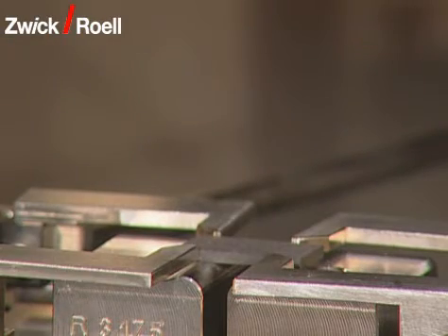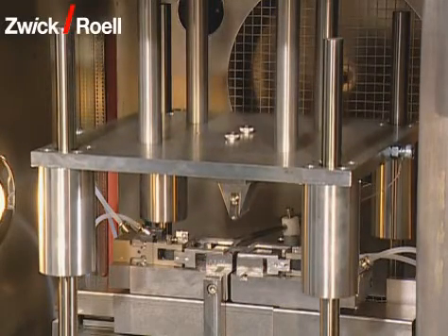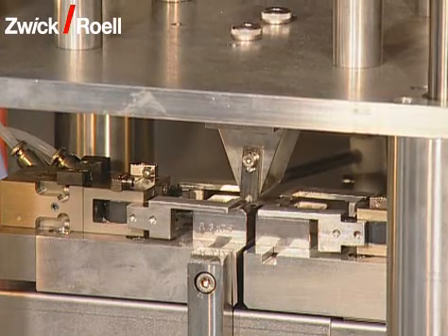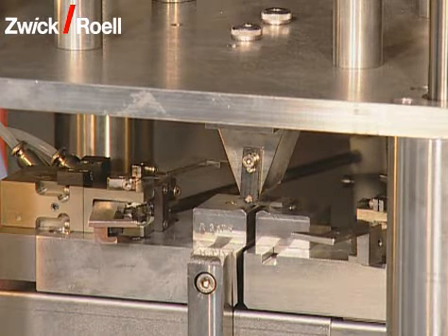There, the specimen is put on the bending table and exactly centered. Now the test starts. With an additional pillar guide, the bending punch is driven on the specimen with high precision. After reaching the preload, the centering is opened and the actual test starts.